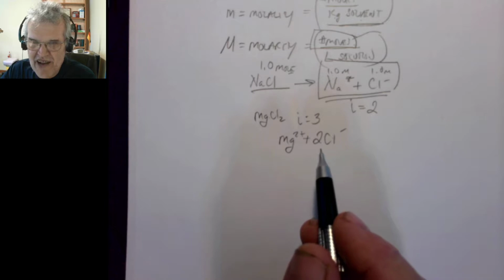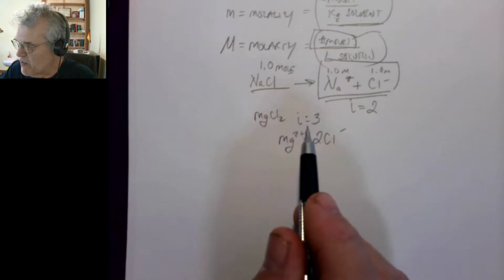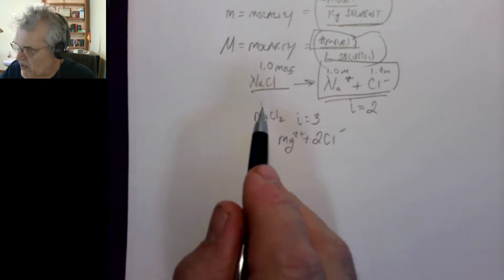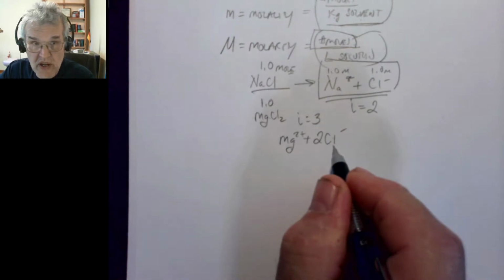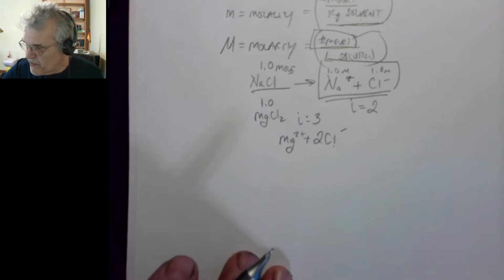I've got it down a little bit more so you can see it quite easily, but if it was magnesium chloride, that Van't Hoff factor would be 3, because 1 mole of this would give me 1 mole of this and 2 moles of the chloride in there. Okay, we don't have to worry about the Van't Hoff factor for this lab. It doesn't come into play because the compound we're dealing with doesn't ionize or anything like that.